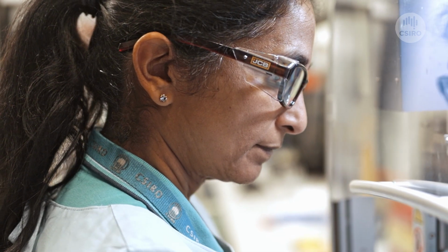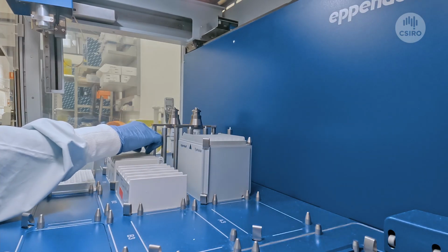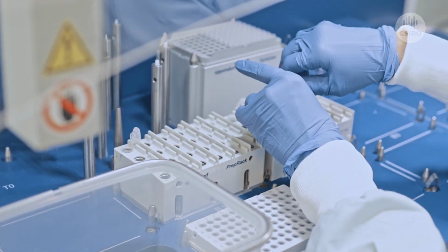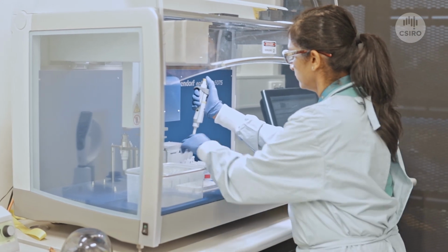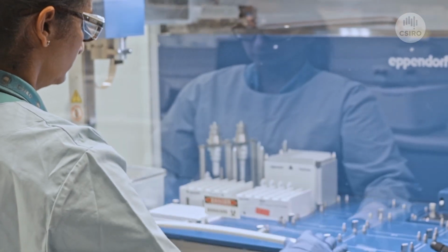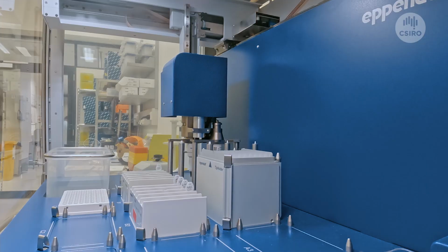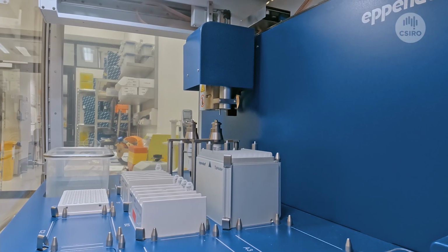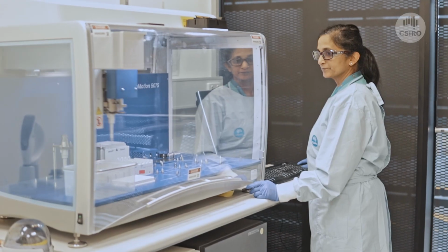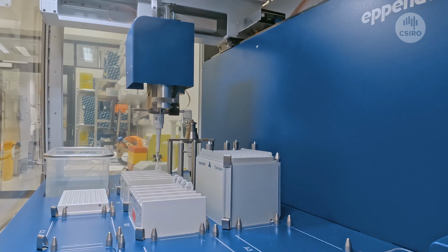We then set up RT-PCR with specific reagents, 2 sets of primers, and a probe to amplify the desired fragments of SARS-CoV-2. We use RT-qPCR to detect or quantify the number of SARS-CoV-2 genetic fragments in wastewater samples using CDC N1 and N2 assays with up to 6 RT-PCR replicates. The assays are very specific to SARS-CoV-2 and do not produce any false positive results.